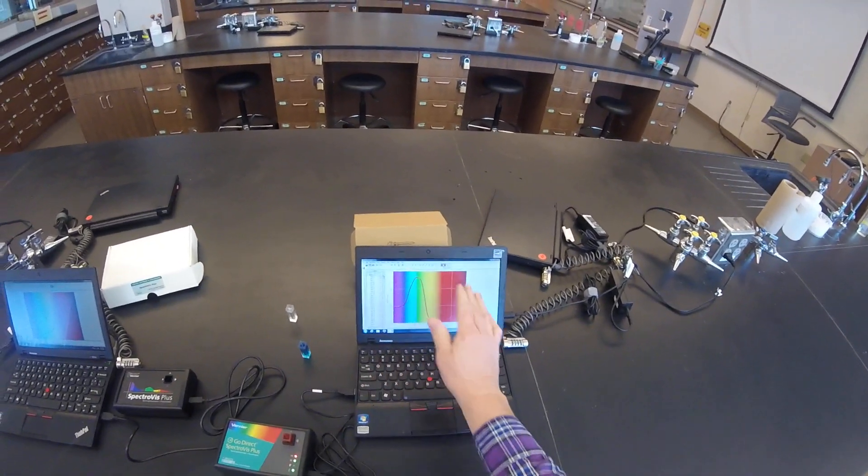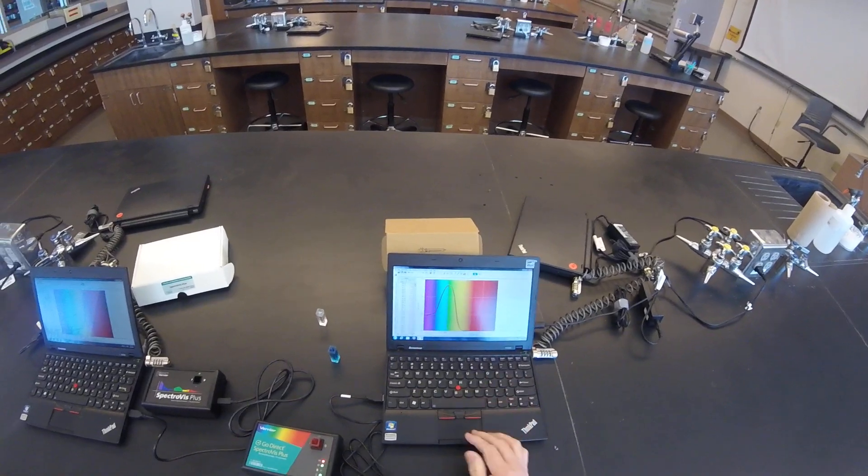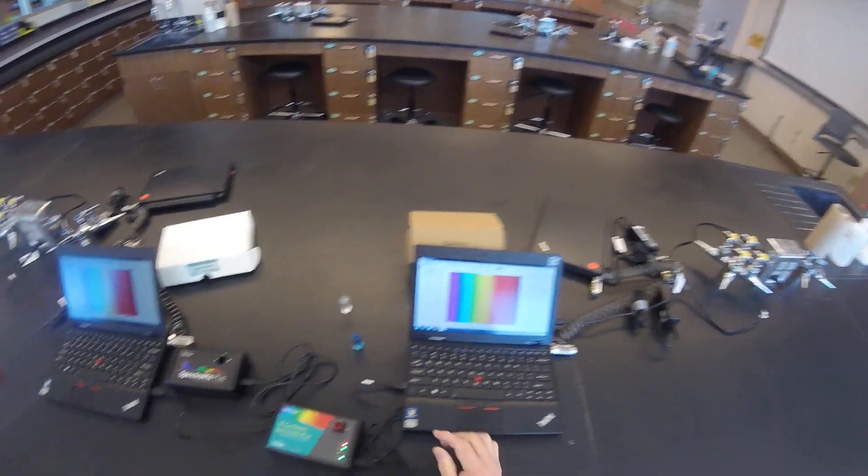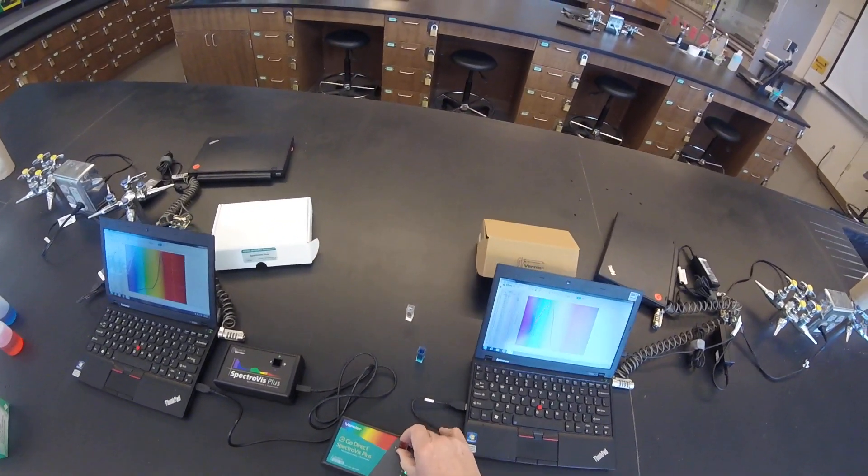You'll see a very similar curve popping up with the same wavelengths, max absorbance and whatnot. If not, I will take out the red.